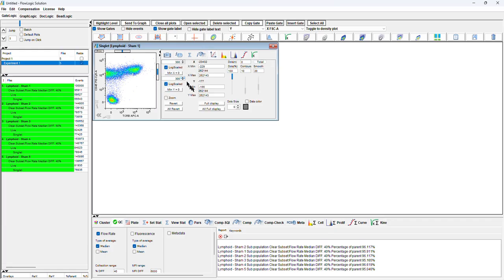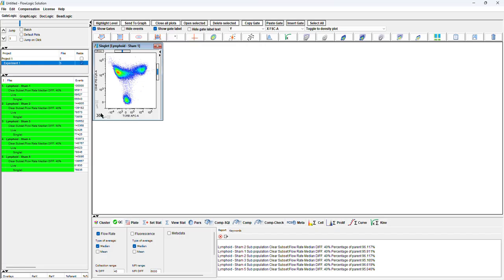So we open another area of Flowlogic where we have scaling, and here you can see the compression of your data, and here is the contour. You can select the contour. But quite interesting here, you can go to full display. Full display gives you an overview of all your data. It's quite useful. Some people like it, some people don't.